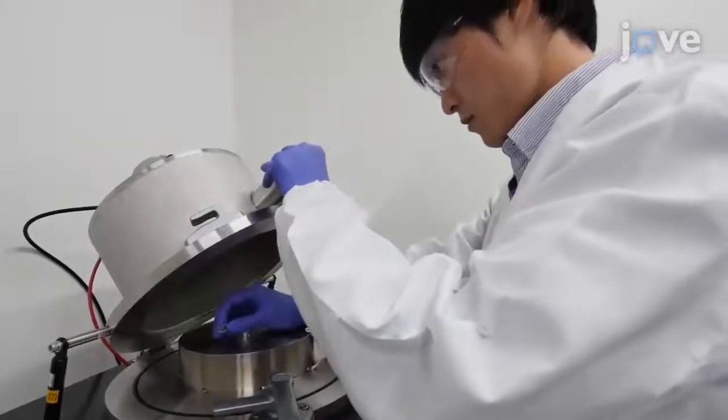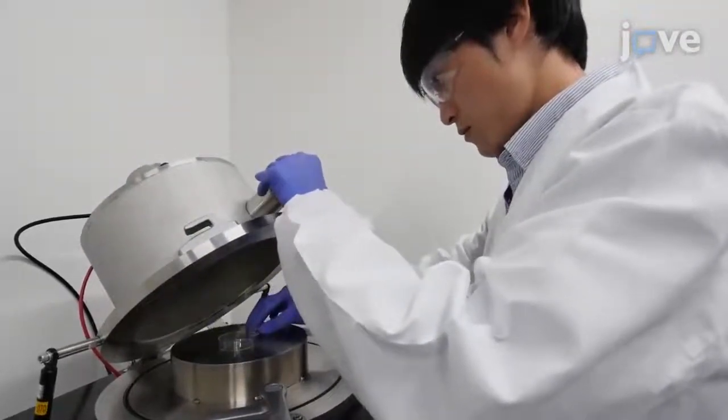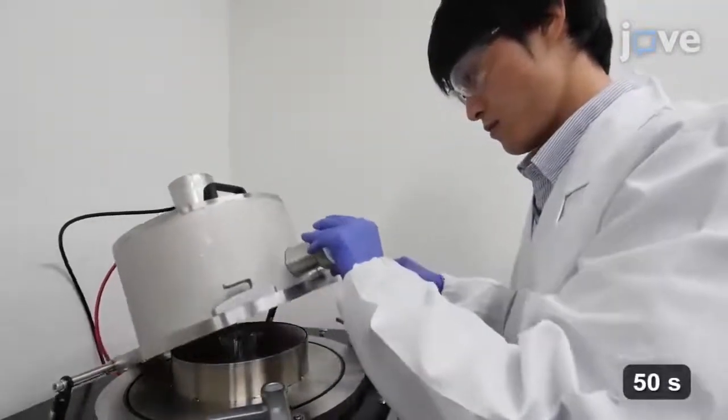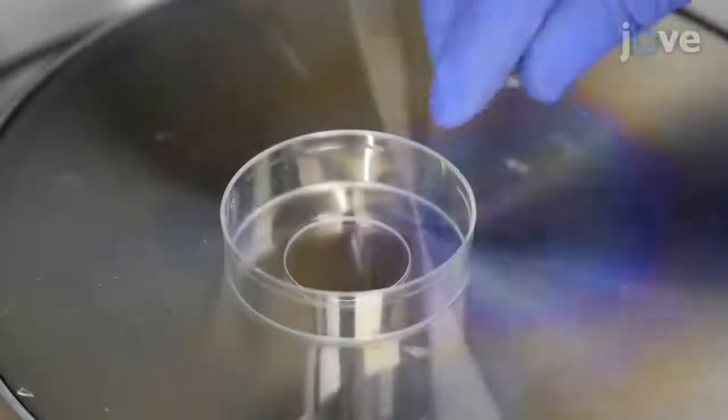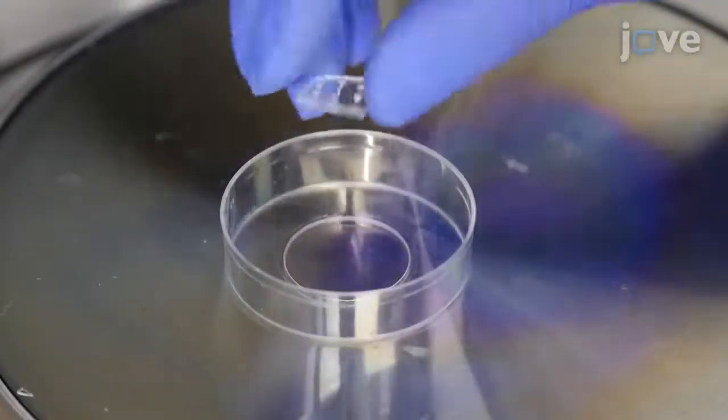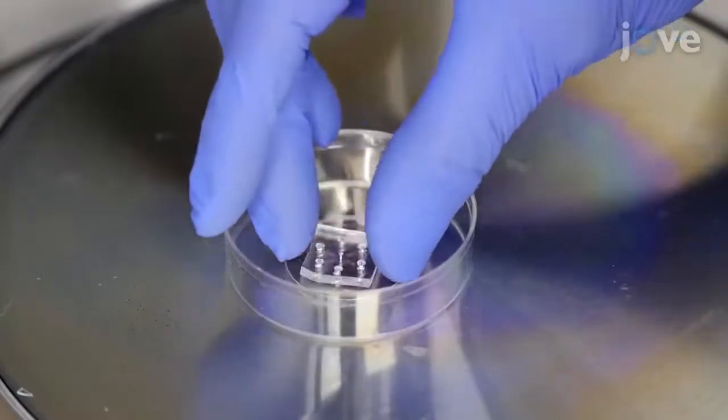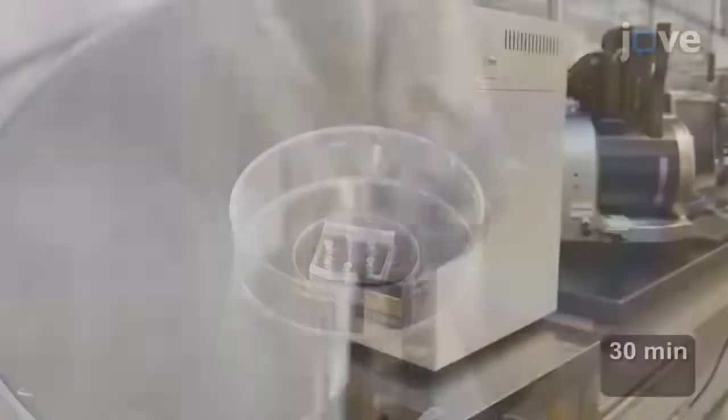Next, expose the PDMS and the 5-centimeter glass dish to air plasma for 50 seconds. To seal off the microfluidic network, press the PDMS layer onto the glass dish and cure it for 30 minutes at 65 degrees Celsius.